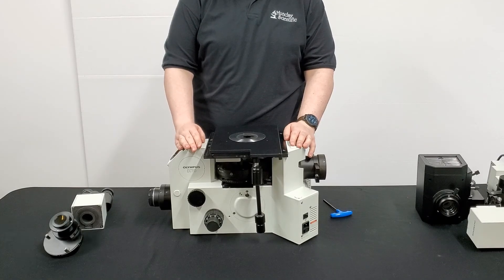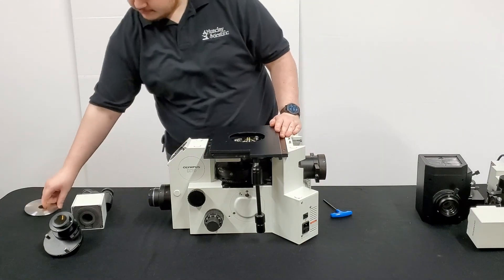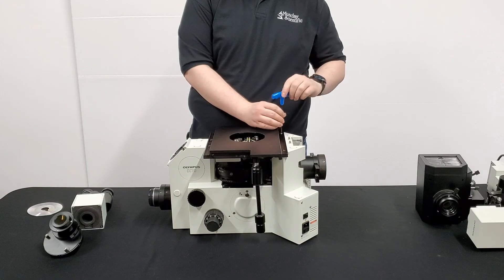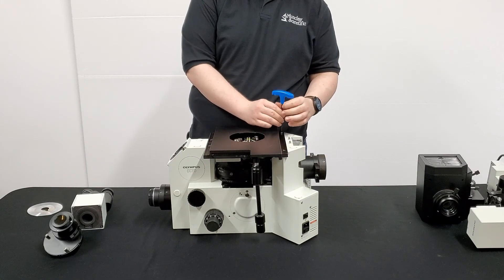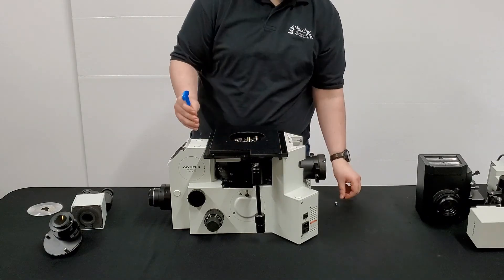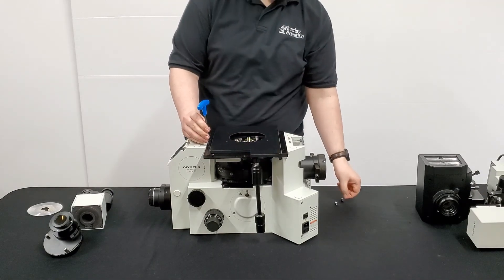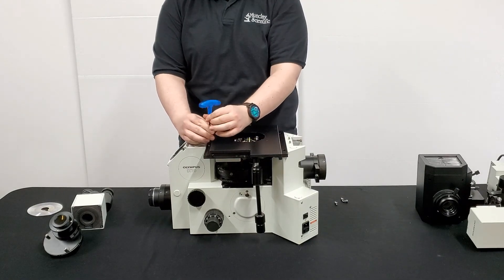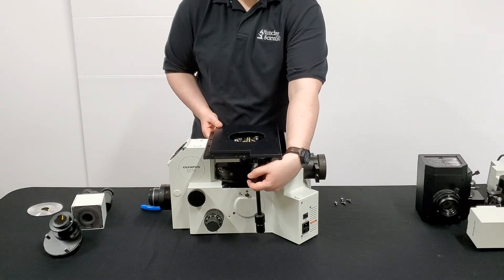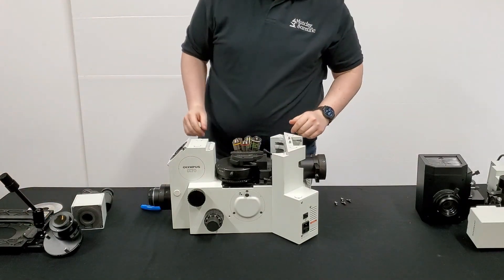Now I'll be removing the stage. You'll notice these four screws and your stage plate. Go ahead and start by popping that stage plate off and set it to the side. Then take your trusty 4mm T-wrench and loosen up those screws and take them out — this does take a minute. Now that the screws are out, go ahead and pick up the stage and set it face down on your work table, making sure not to damage the coax.